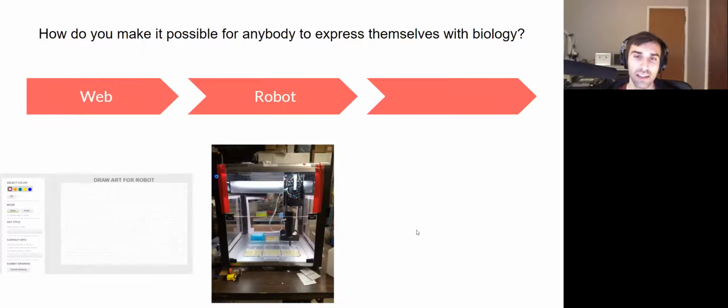Yeah, Corinne, I would love to explore alternative ideas working with agar. We may want to move away from actual agar because agar gels tend to be kind of brittle. They tend to break if you manipulate them. But there's other hydrogels that are a lot more flexible, and you should be able to unpeel from a petri dish and just stack on top of another petri dish. You could also imagine setting the robot to pierce the agar and have it grow within it, and then another layer on top too.